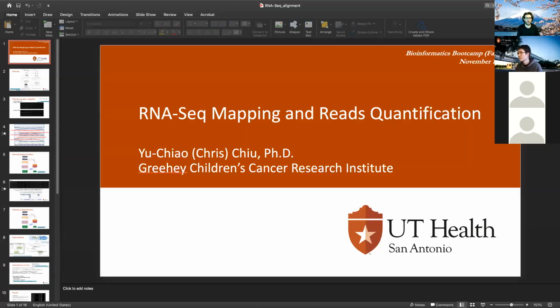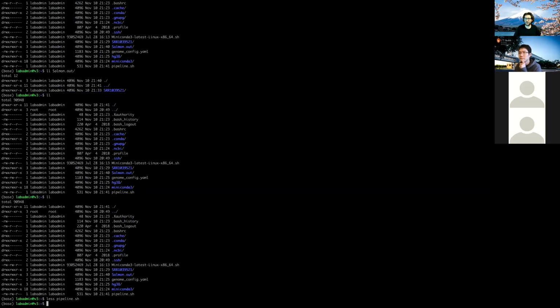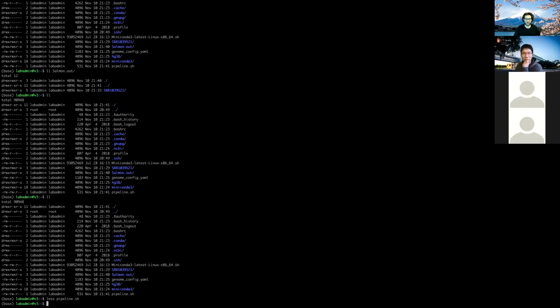Because if you remember how we left it last time, there's some data sets that you actually have to go all the way back to the raw data in order to process. And this is how you would actually go about that. So without further ado, Chris, why don't you go ahead and get started?